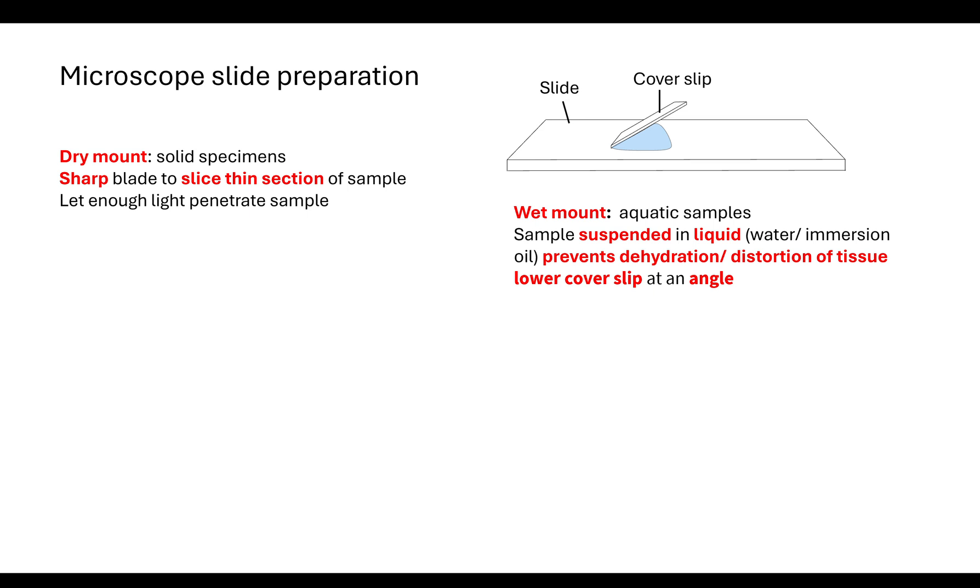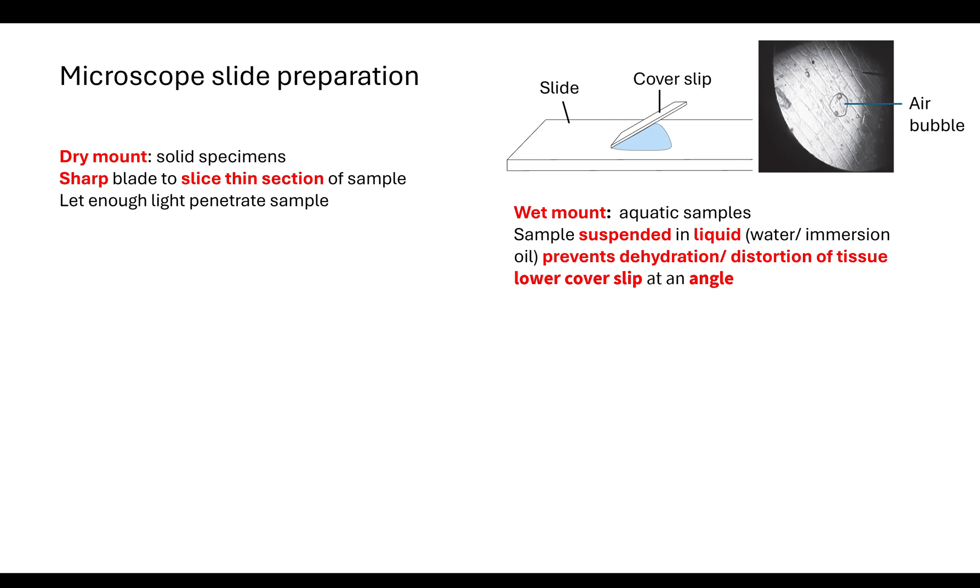It's important that the liquid completely covers our sample. To do that, we place our cover slip at an angle on top of the liquid and then slowly lower it down until it is completely covering the whole specimen. By doing it at an angle, the liquid will stick to the cover slip and, as you lower it slowly, that should prevent air bubbles from being within your sample. It's important that you can identify the difference between cells and air bubbles when looking down the microscope.